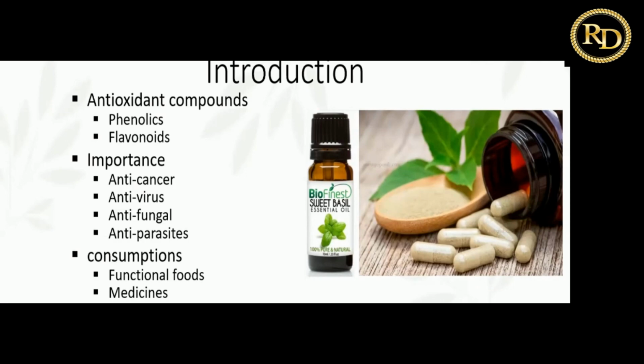In this study, treatments were a combination of 3 levels of temperature, including 40, 60, and 80 degrees Celsius, combined with 3 levels of ethanol, including 60, 70, and 90%. The experiment was organized in a 2-factorial CRD with 4 replications and 3 samples per replicate. Parameters such as percentage of extraction yield, total phenolic content, total phenolic yield, total flavonoid content, total flavonoid yield, and antioxidant activity were investigated.